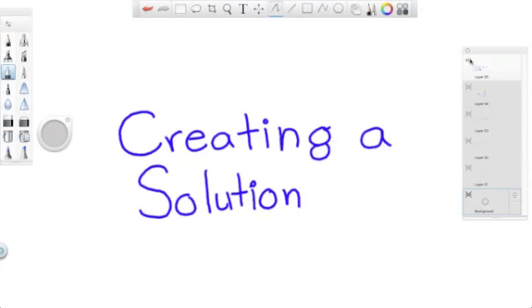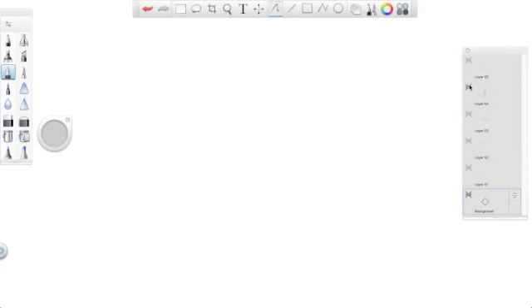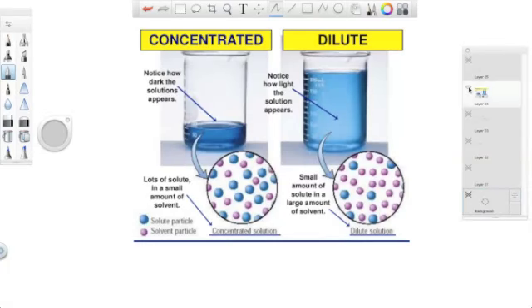In this video, we are going to create a solution. Concentrated solutions contain a large proportion of solute relative to the solvent, while dilute solutions contain a small proportion of solute relative to the solvent.